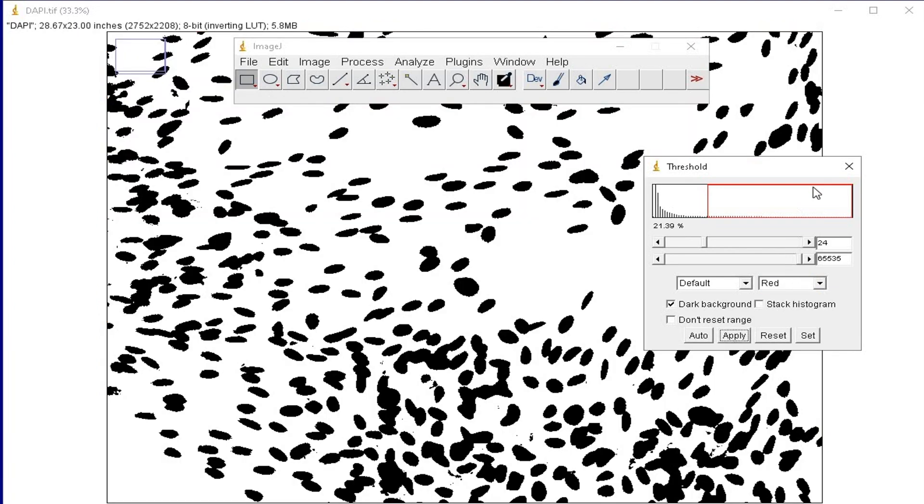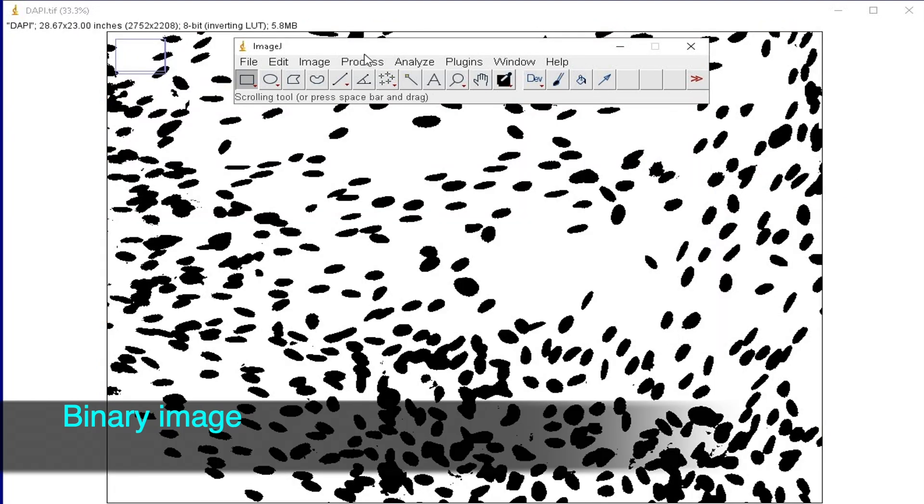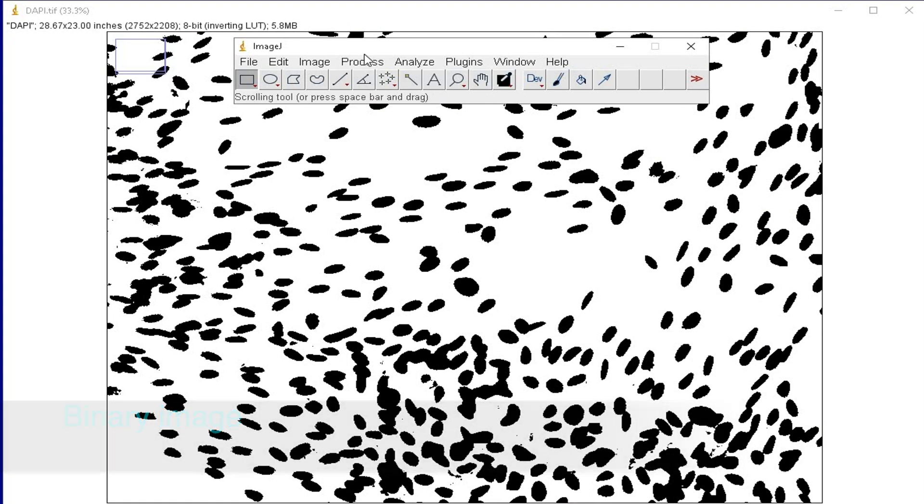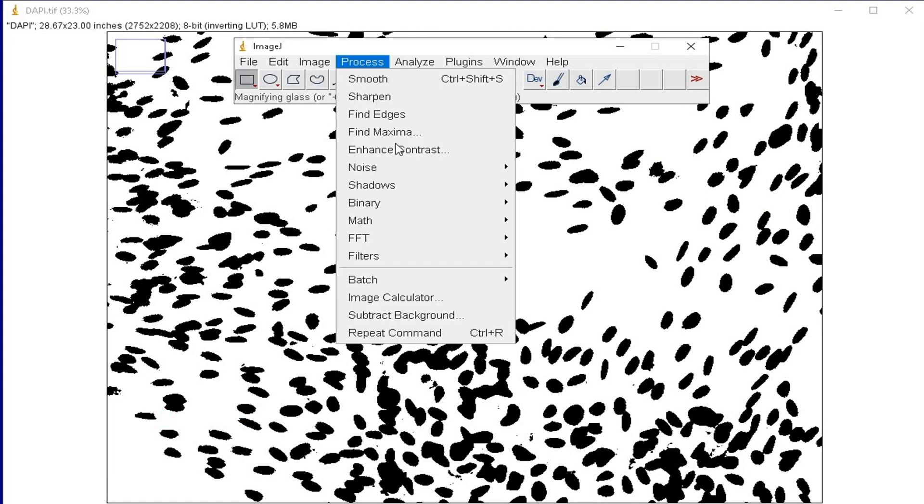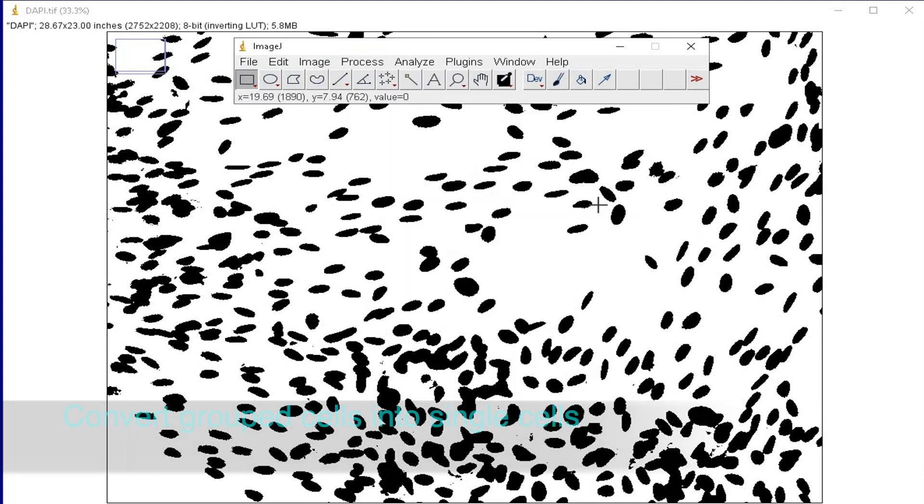The threshold window can be closed safely. The next step is to convert the image into binary. To do this, click on Process, Binary, and Make Binary.